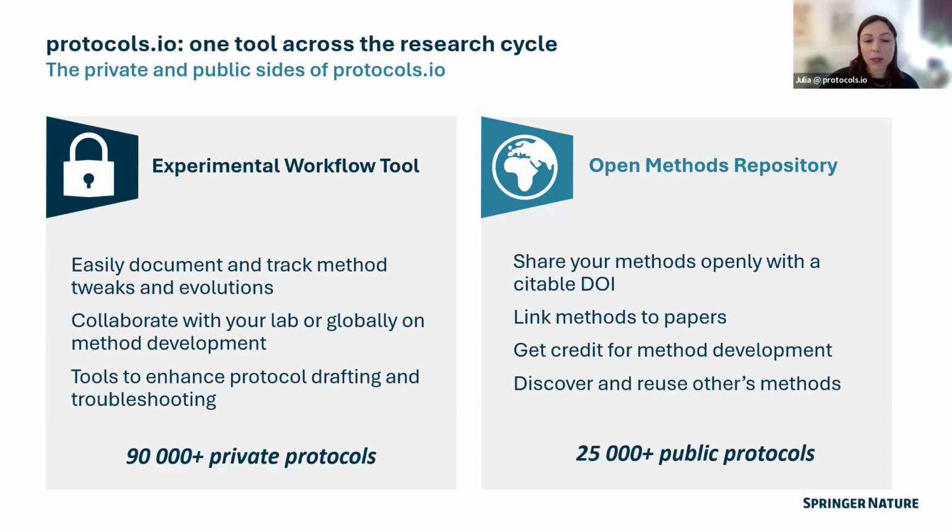Because you're working in a really structured format from day one, when you do finally come to publishing those methods for a manuscript, to comply with funder requirements, or just to make that available to a collaborator, you're already 90% done with the work, and it's really easy with a click of the button to publish that. And so that open sharing becomes a really nice benefit of having good, rigorous workflows from the start.